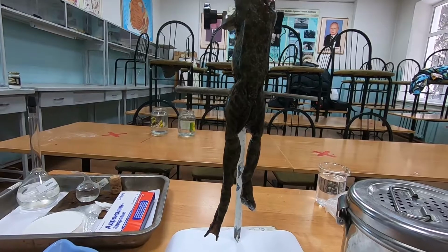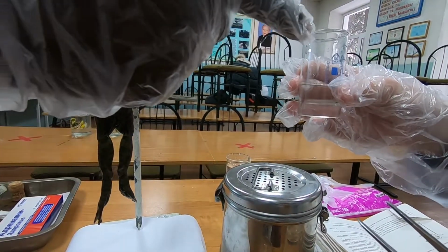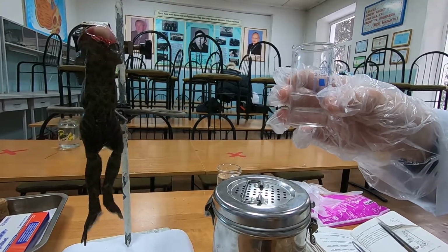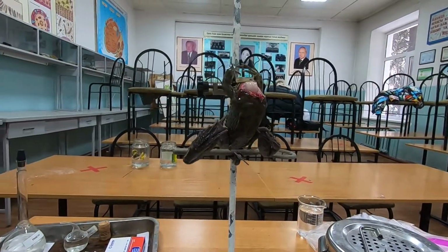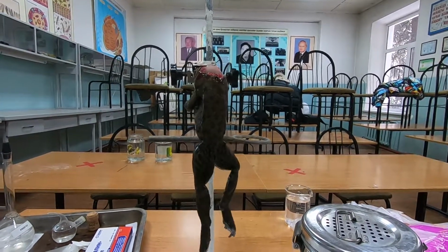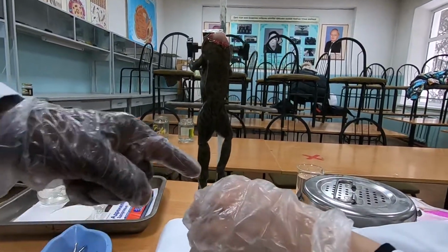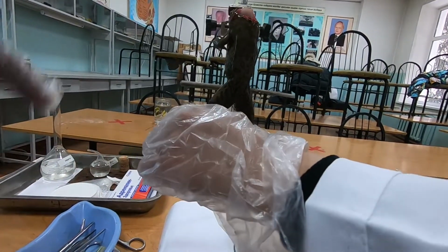So, students, this is the reaction when we put the legs on 0.5% sulfuric acid. So what we do is, take it, hold it. So, put it down.